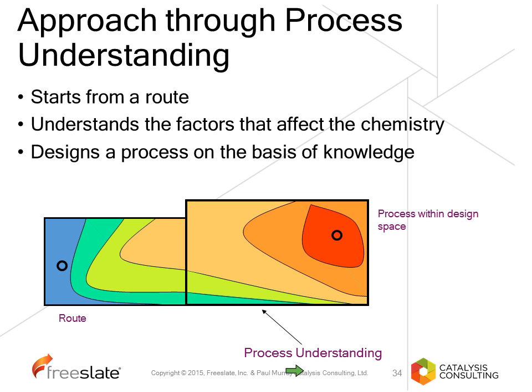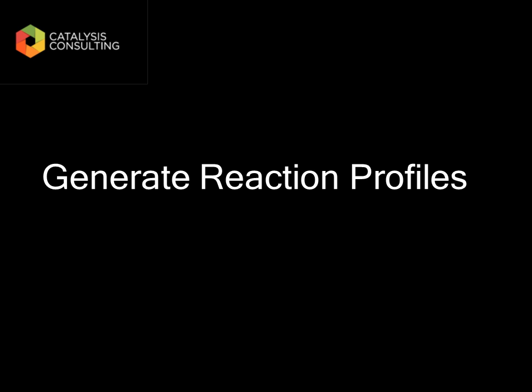Experimental design is a very powerful tool in helping you to gather the maximum information from the minimum experiment. From my experience, it is extremely important to try and generate reaction profiles from each experiment that you carry out. And this is where automation can be a significant aid to carrying out experimental design. So why should we generate reaction profiles?